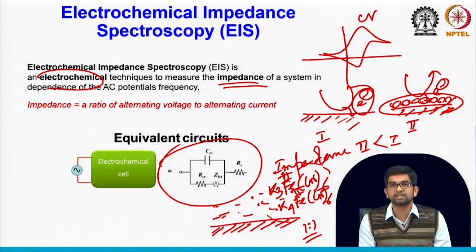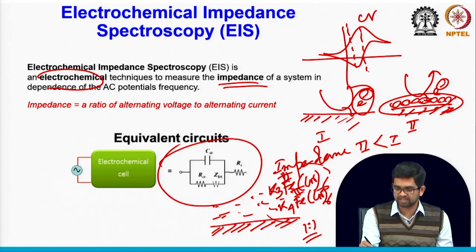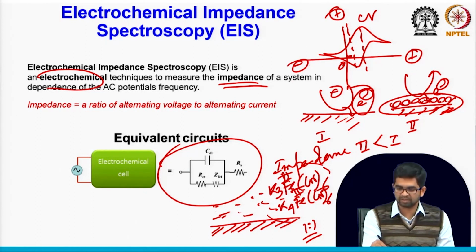Before the impedance measurement, you have to collect a cyclic voltammetry of this electron mediator. Then you have to calculate the formal potential. So the formal potential, basically, if this is 0, here is the negative side, here is the positive side, up positive, down negative. If you measure the cyclic voltammogram for the potassium ferrocyanide, where iron is in oxidation state 2.